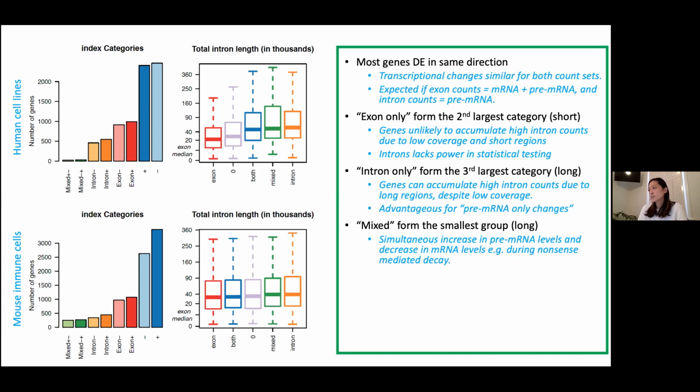The mixed group is a fairly small group, so I don't want to go through too many guesses of what's happening there, but biologically this could certainly happen where there's an increase in pre-mRNAs at the same time that there's a decrease in mRNAs, for example, in nonsense-mediated decay.